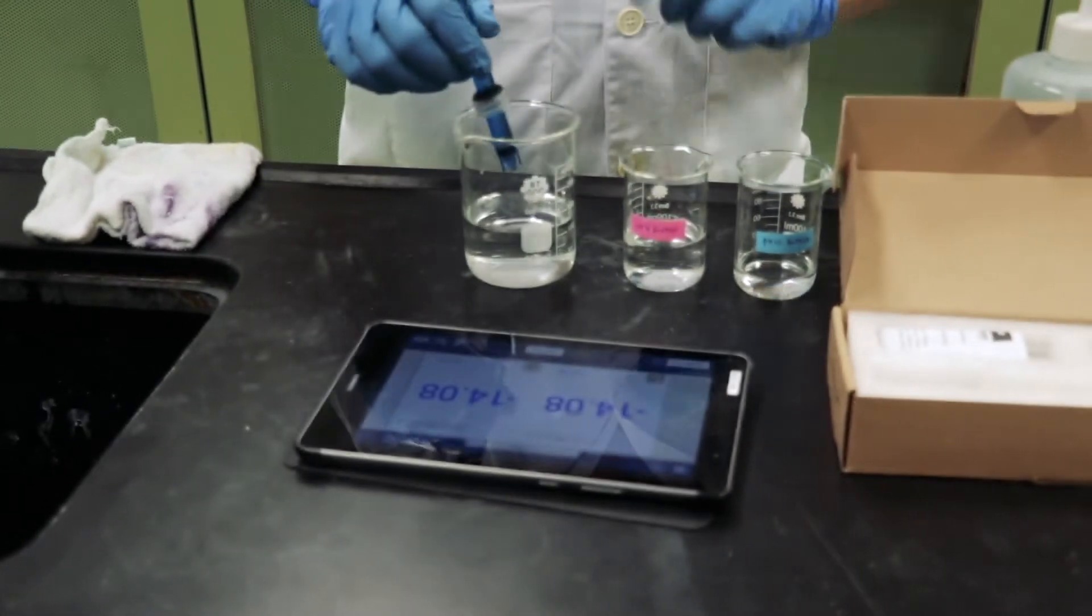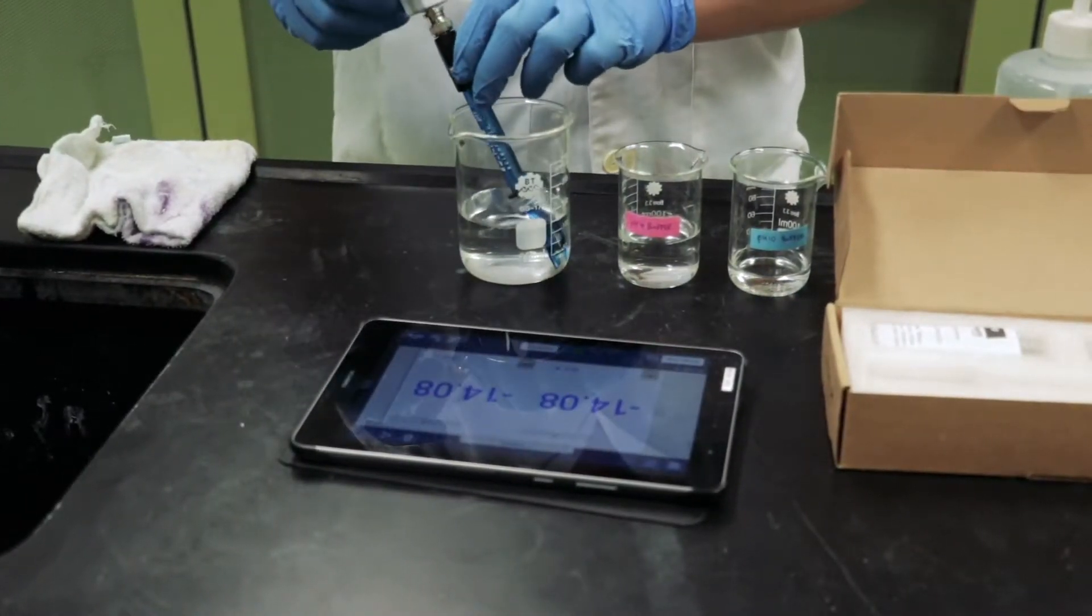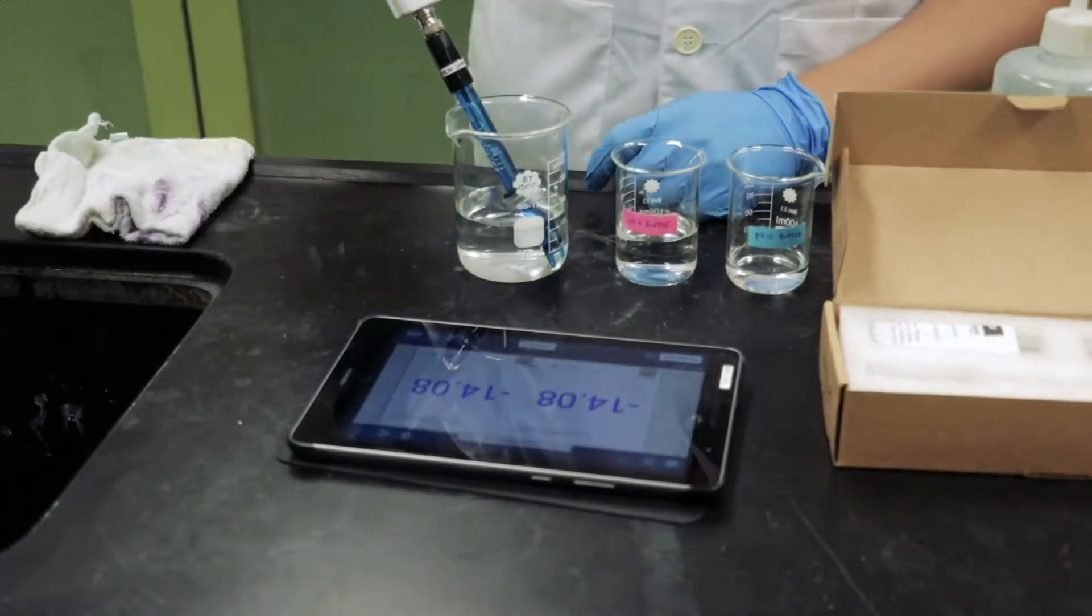Secondly, beware of rims of beakers and conical flasks when immersing the PH Probe in any solution.